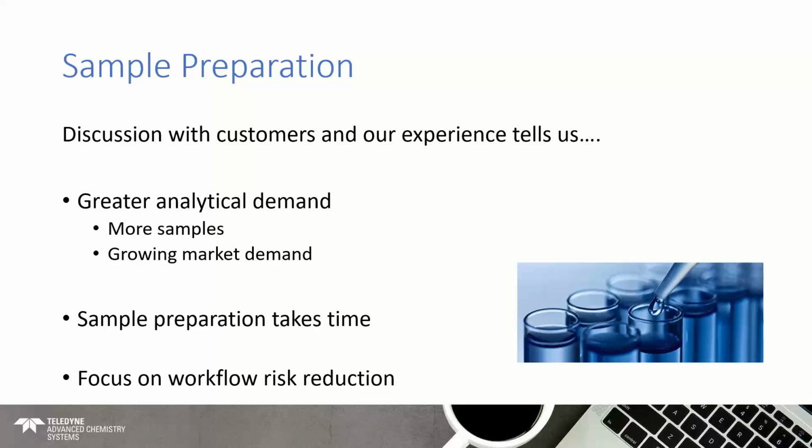For trace element analysis, we're also seeing a growing demand in other markets. Trace element analysis grew out from the environmental market and the geological market, analysis required for those applications, but over the years we've seen growth into pharmaceuticals, into food testing, etc. So there is more and more trace element analysis required in wider markets than you would typically expect.